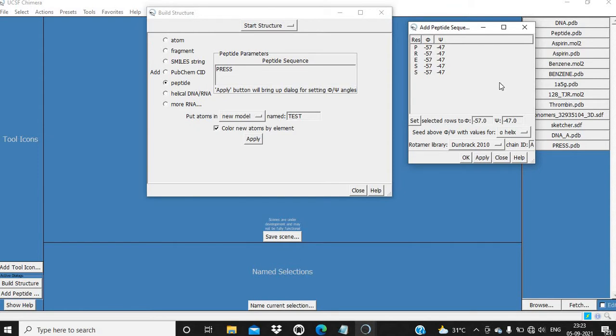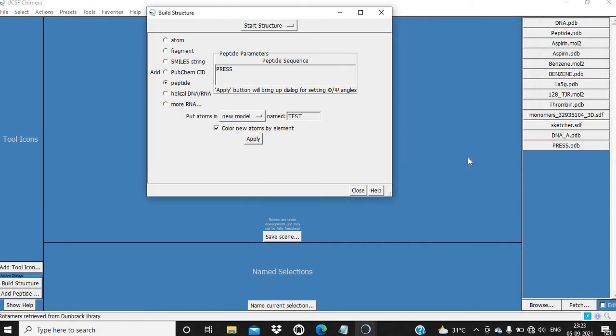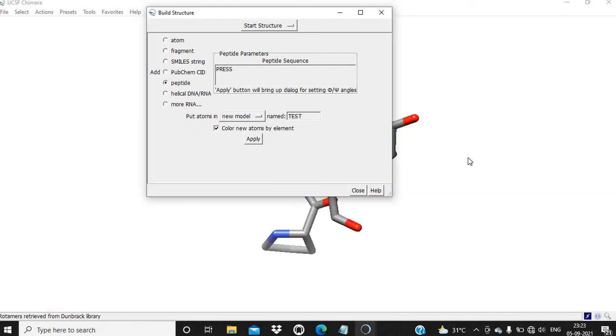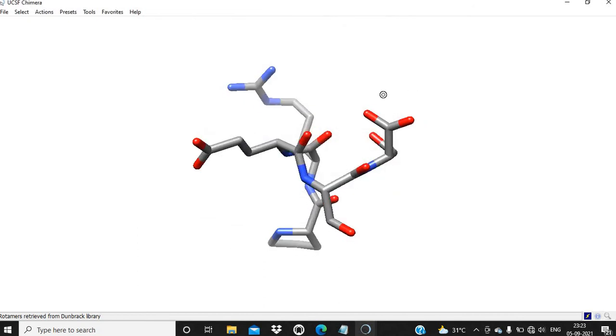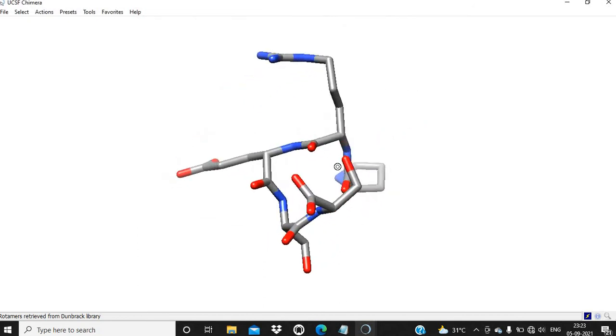By default, I am going to choose this alpha helical option, and you can see this peptide here.